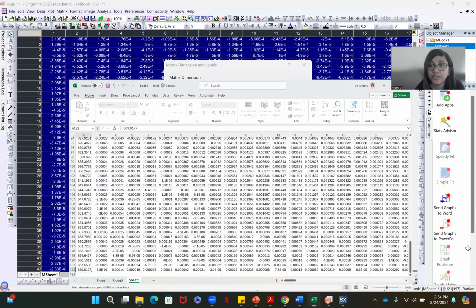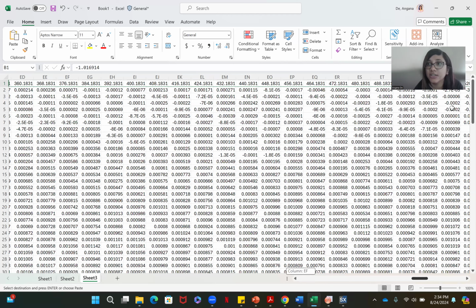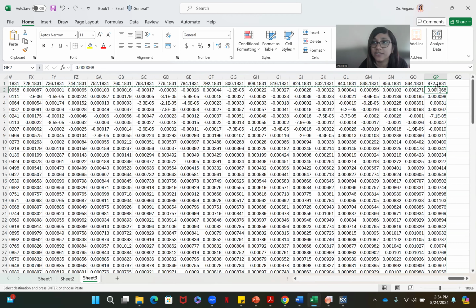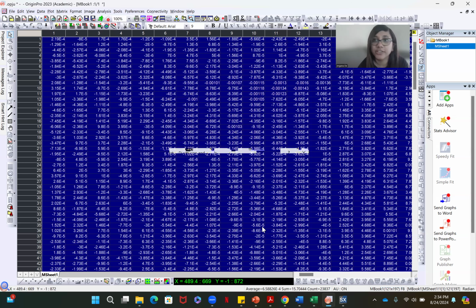Okay. And then Y is going to be time, right? So you gotta check what that is. So it starts at -1 picosecond and it goes till 872 picoseconds. So -1 to 872. And that's it. You select OK. Everything is set. Now you just have to plot it.